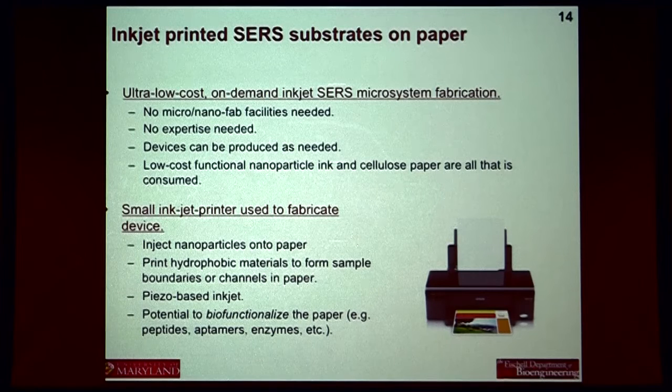There are companies that sell sophisticated piezo inkjet heads. There's a company called Microfab where you can buy piezo inkjet heads and make your own printer. And there are inkjet printers with piezo heads that can cost up to $200,000 or $300,000. So when you talk about quality of printing and so forth, there's certainly a scale. We actually started out just thinking, let's see if this works. And it worked, so we stuck with it, basically. Again, when we talk about commercialization, we can talk a little more about printer options.